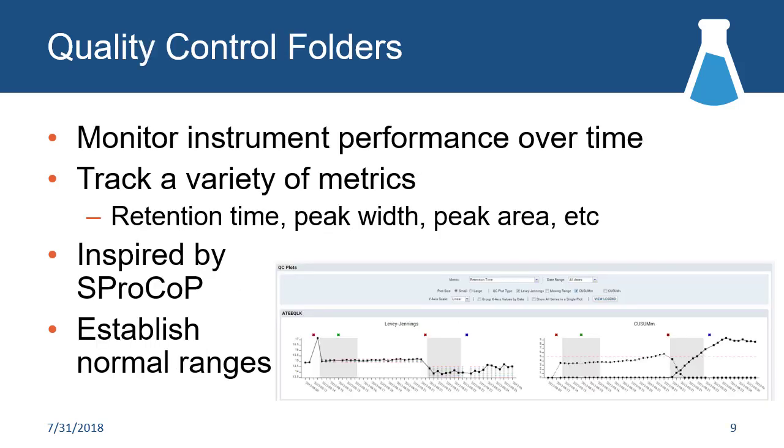So then going to the next major category of use, these quality control folders. I'm sure Lindsay will probably start her slide by correcting that as a name. We tend to just refer to it as QC, but really it's about system suitability a lot of the time. And so we're monitoring the instrument, or the chromatography before the mass spec itself, monitoring its performance over time.